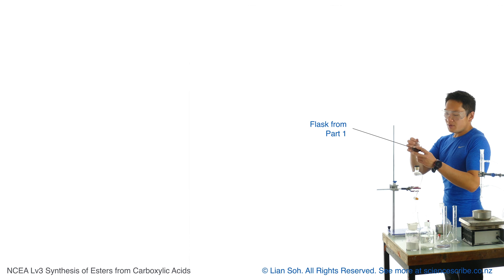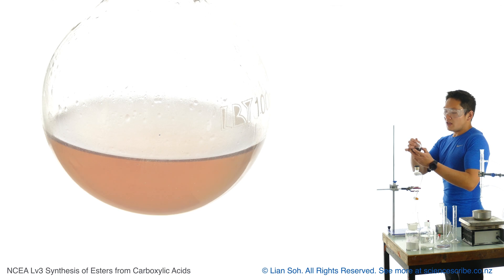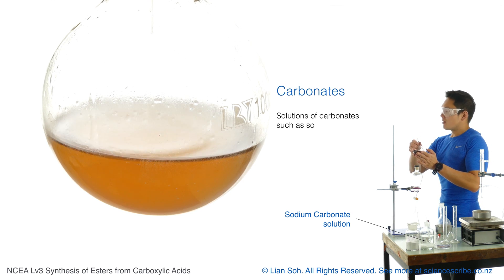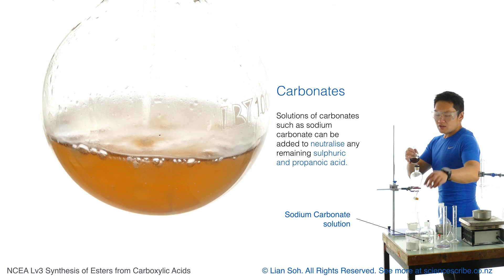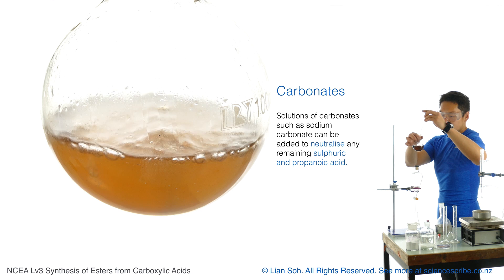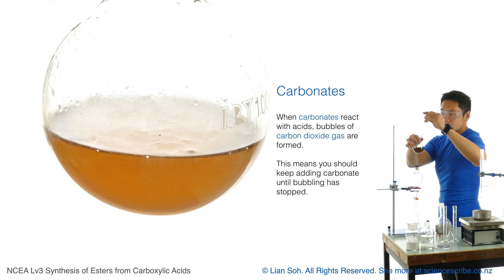In this flask, there could be some concentrated sulfuric acid still left, along with leftover alcohol or leftover carboxylic acid. I did add a little bit more carboxylic acid than alcohol, which means there is sulfuric acid and our original propanoic acid in there. I want to get rid of these, so I want to neutralize this mixture by adding some sodium carbonate solution. Carbonates will form bubbles when added to acidic mixtures.